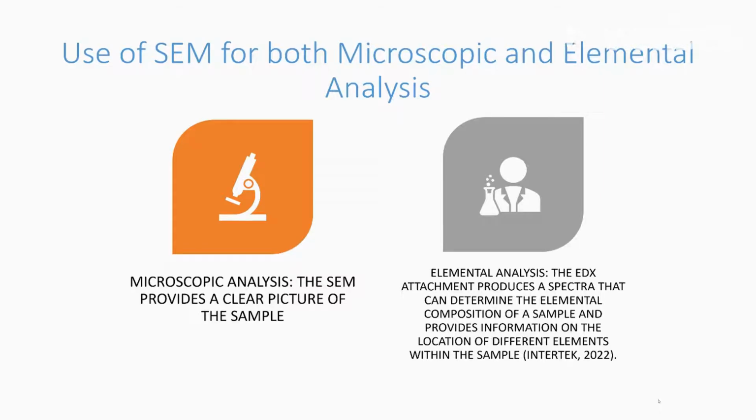So the combo SEM EDX can be used for both microscopic and elemental analysis, like I was just talking about on the last slide, where the microscopic analysis provides the picture of the sample, and the elemental analysis is done by the EDX attachment, where the composition of the sample and the elemental mapping is completed.